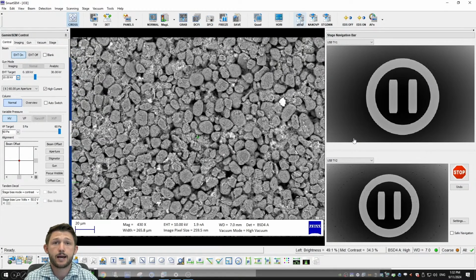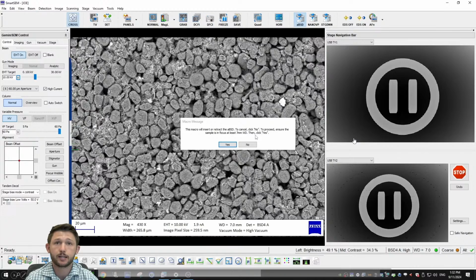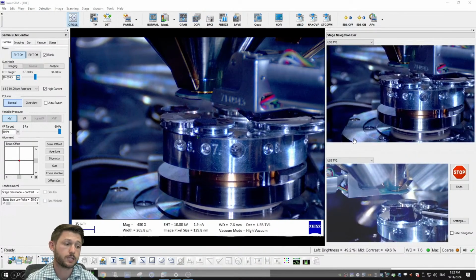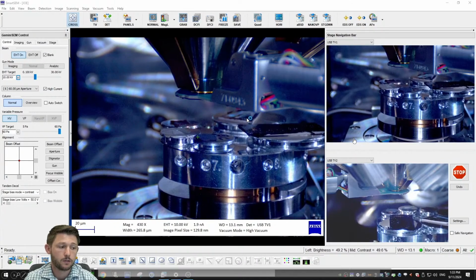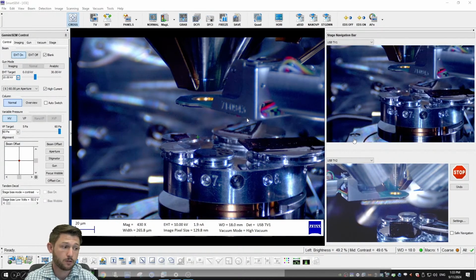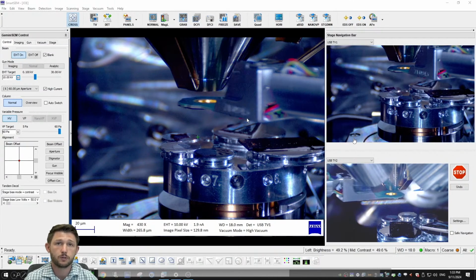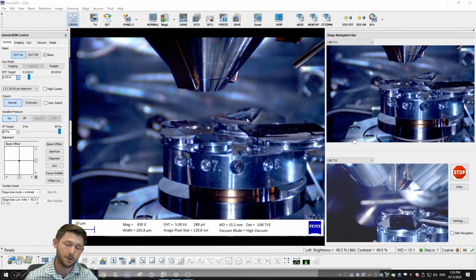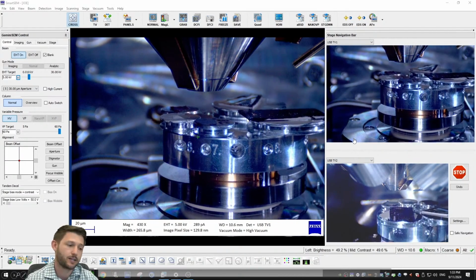And then let's say we capture images, we're satisfied, we just click that same button and it's going to perform the same steps in reverse and remove the detector now. Now, if you did not utilize this macro intrinsically, whenever you insert or retract the detector, it will drop the stage. But what this macro builds upon is bringing it back to that same position for imaging, as well as changing conditions when we're going from ABSD imaging, from our backscattered electron imaging to our secondary electron imaging.